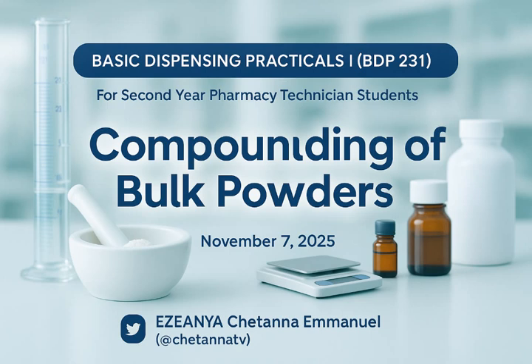I've told you about bulk powders and divided powders. So today we look at bulk powders. By God's grace, we'll try as much as possible to do practical on bulk powder for internal use and bulk powder for external use.